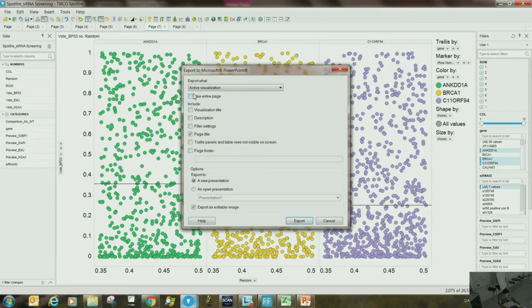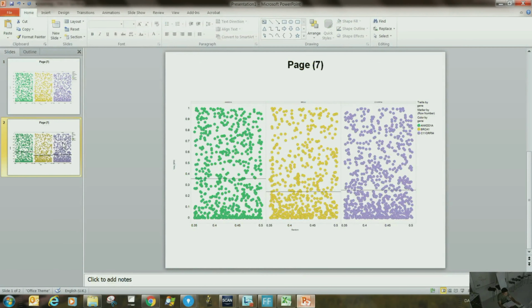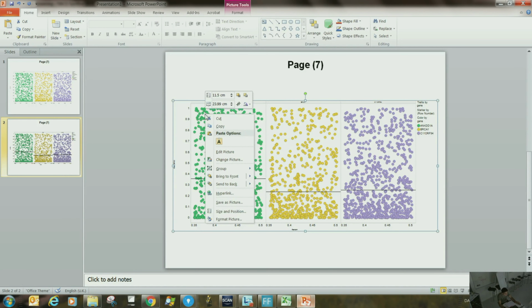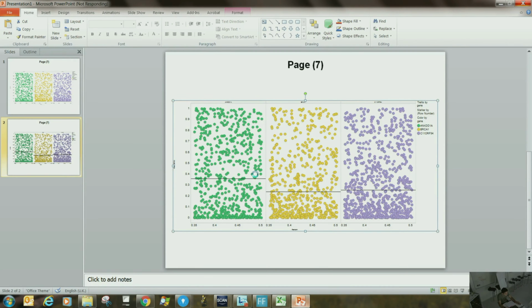So if you go like this, by the way, you can actually ask them to present the second slide, export it. Now this is editable, right? Right click and say group, ungroup. That's fine, yes. It's ungrouping all the objects. The reason why it's taking too long is because... Oh, sorry, I should have done this. But you understand now.